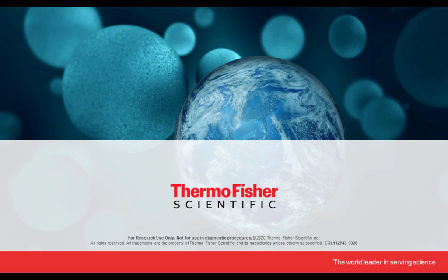Now if your target protein is identifying lysines only, so antibodies identifying lysines only for that particular target protein, there is a possibility that there would be interference with this. As I said, this probe binds to about 30% of lysines, so not necessarily it would specifically target that antibody binding pocket, but again, because it's binding lysine, there is a probability that you would see some diminished signal from your antibody.